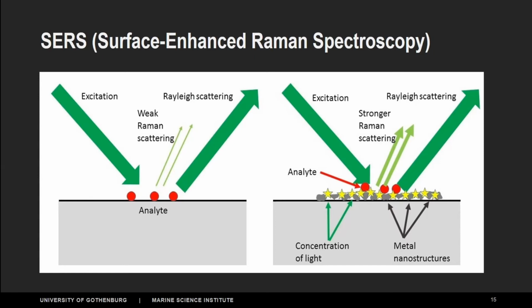So I'm working with colloidal solutions, so liquid form with nanoparticles, because it's easy for testing. If I run hundreds of tests, I do not have time to dry them, put them on a substrate, and analyze. That would increase my testing time a lot. But once we have a result in the liquid form, it will be just a matter of transforming them into a dry form. We are going to put them on a surface, and there are different methods to do that.